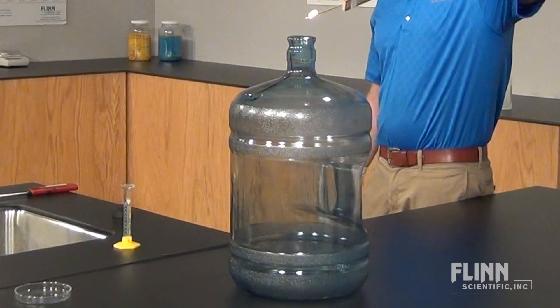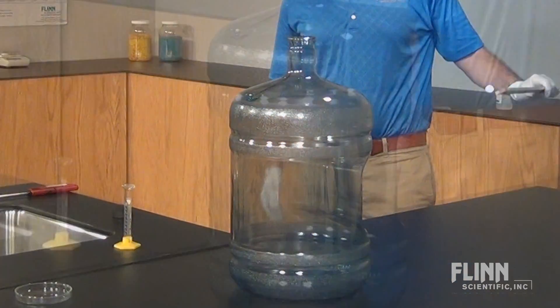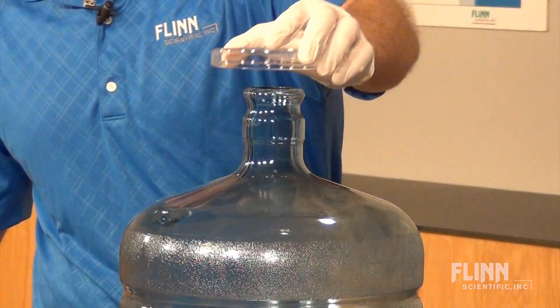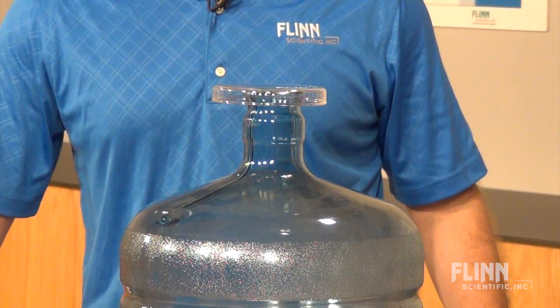Do not perform directly under smoke or heat detectors or sprinkler systems, and make sure the ceiling is at least four feet above the woosh bottle to prevent possible scorching and fire. Place a cover over the jug's mouth to stop the combustion process if the jug begins to melt.